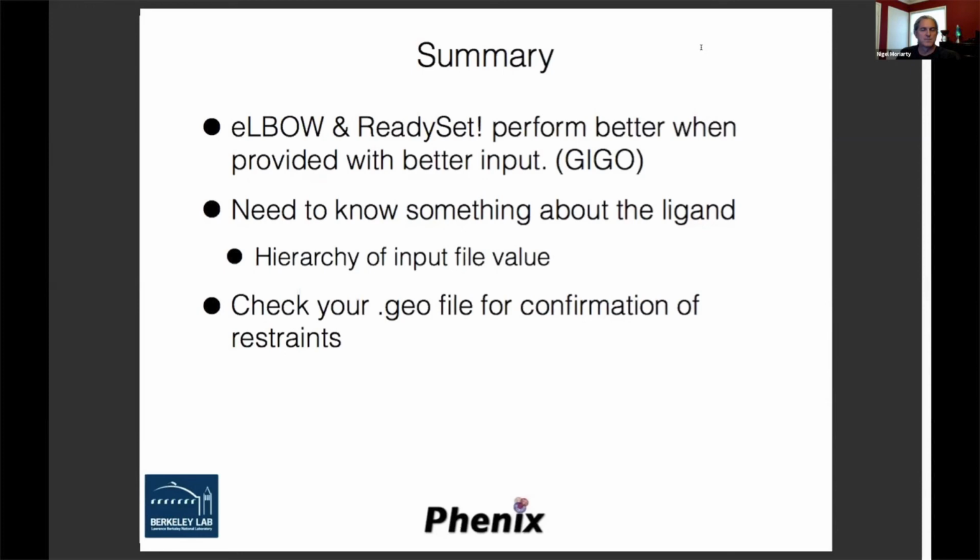I see another question from Bonnie: best practices workflow when working with metals. Let me answer that. There's not a good tutorial anywhere. I'm sorry, that is on the list to generate. At the moment, the metal coordination stuff is in a state of flux. If you'd asked me this question a year ago, I would have said that there's different features available in Phenix.